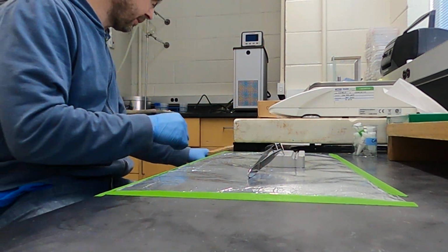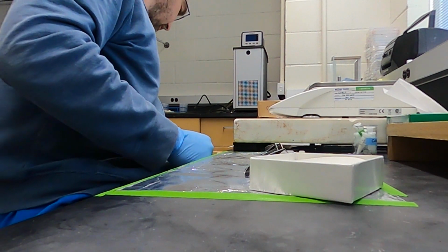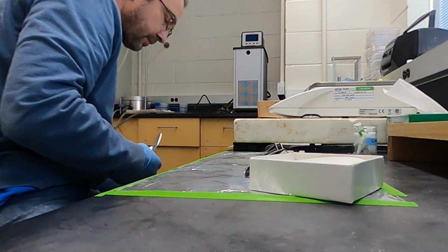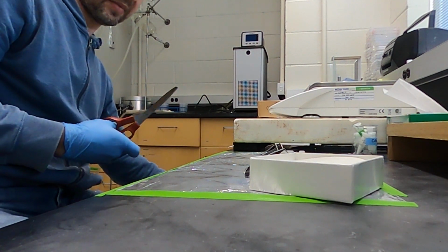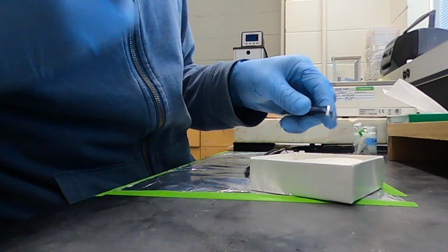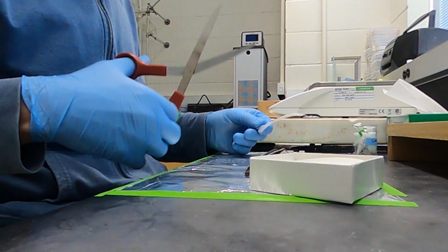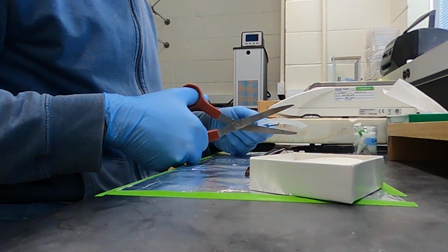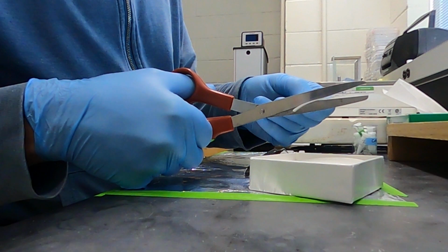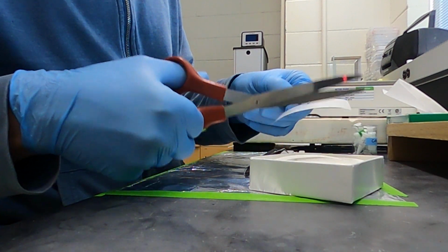So now the paper. So the weighing paper is here. And what we do, there. That's the compressor. That starts with me every time and it's very annoying. So we cut little square of weighing paper.